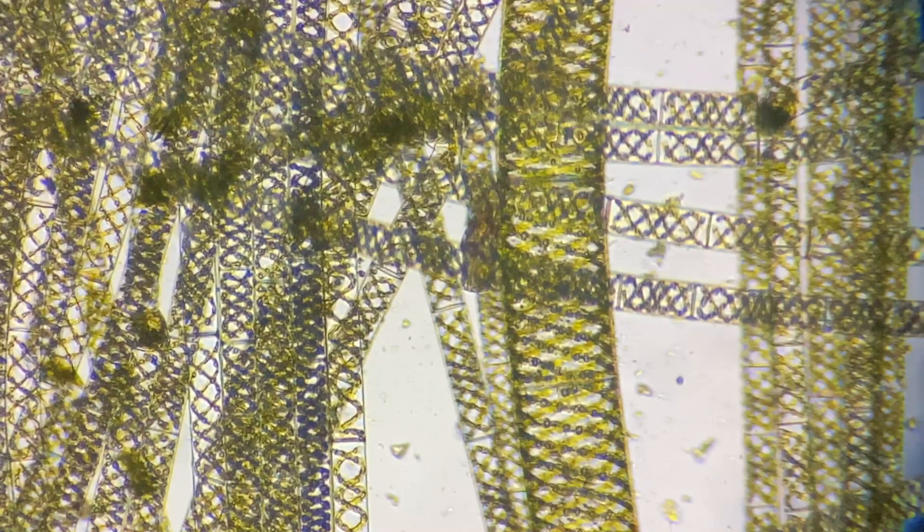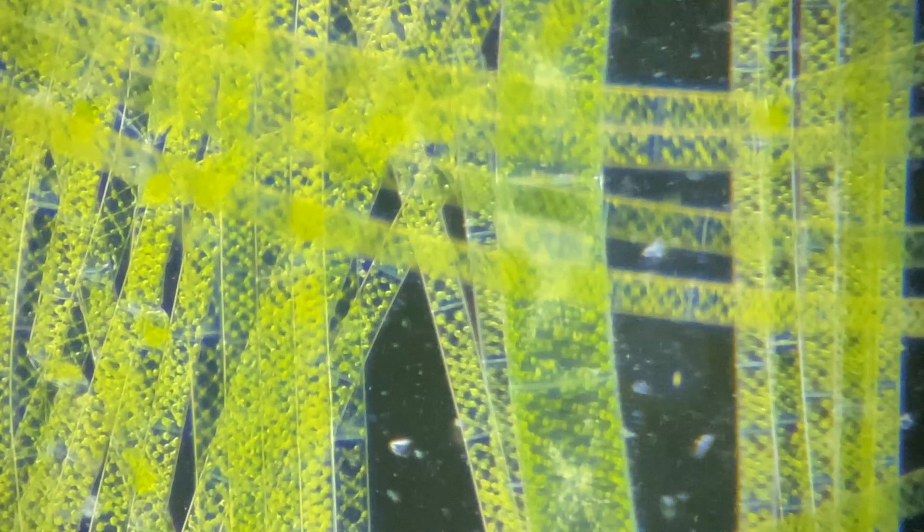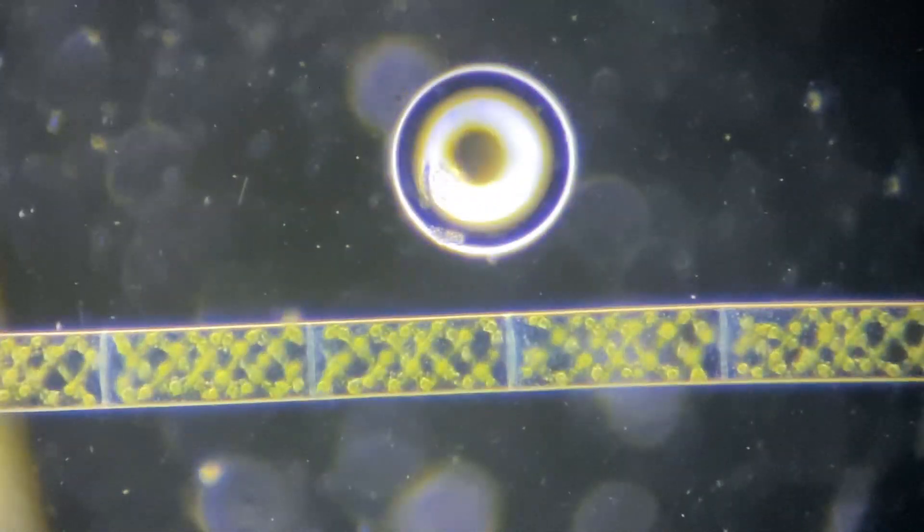I'm about to put one of the small — I think the smallest — dark field filters in and just slide it right in here. Then I'll open up the aperture and now we have dark field. It looks so cool! In this little air bubble you can actually see the shape of the filter I've put in. If you go to the next magnification level up, it will still be dark field, but at 600x it will no longer be dark field. You can then put in a different filter with a wider circle in the middle to get dark field at higher magnifications.